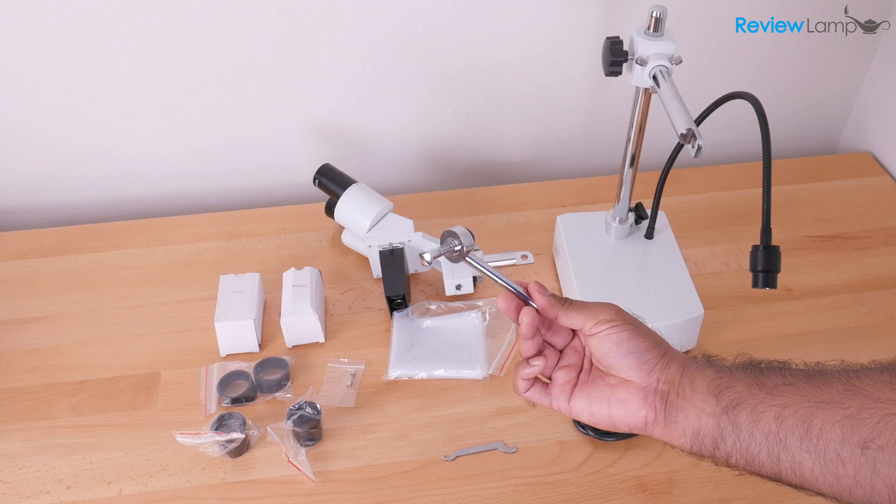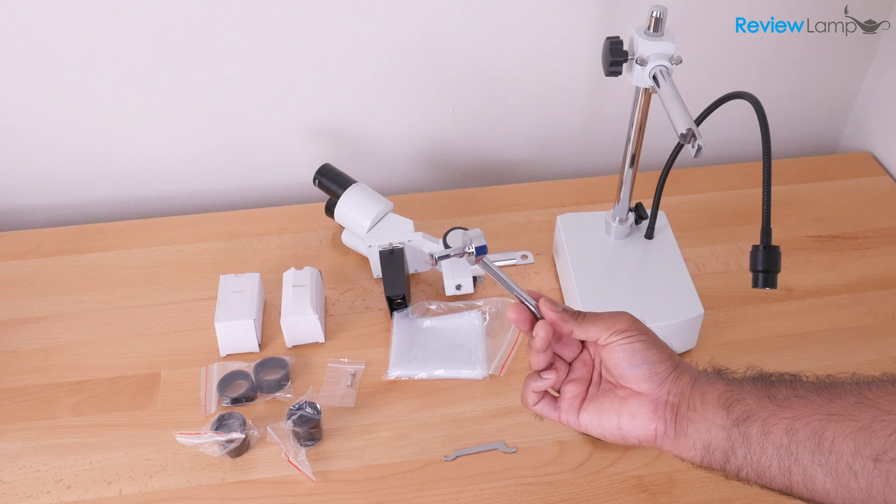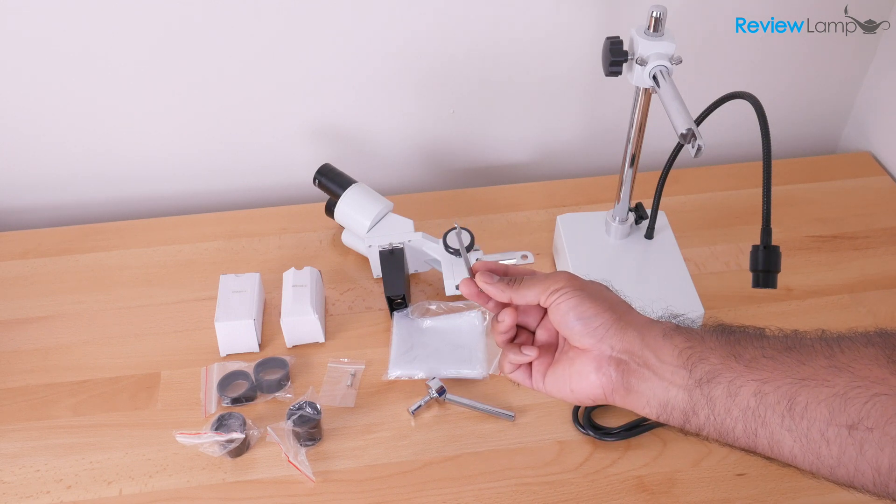You have a locking bolt and handle. This is what we're going to use to connect the microscope head to the base. There's a little wrench. I'm not exactly sure what we're going to use this for, but they've provided it in any case.